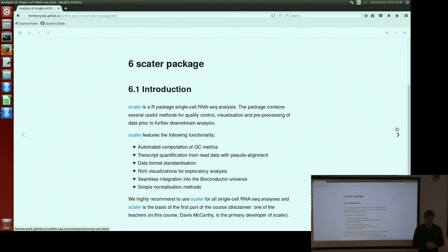So that's a nice way to structure an analysis. And then the other benefit is that when you have a standard type of object in R, then you can write methods that operate on those objects, and knowing what is going to be in the object allows the programmer to do things a lot more securely.